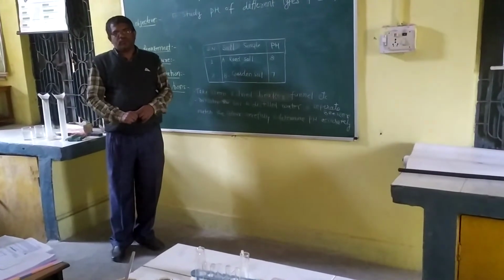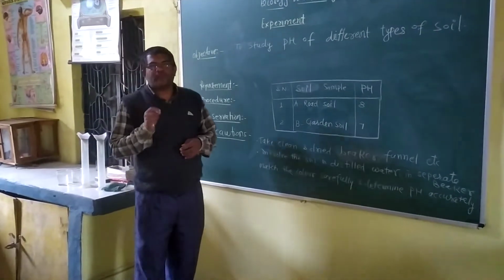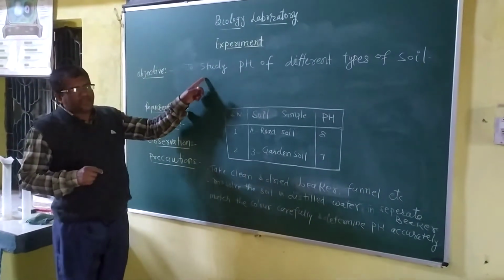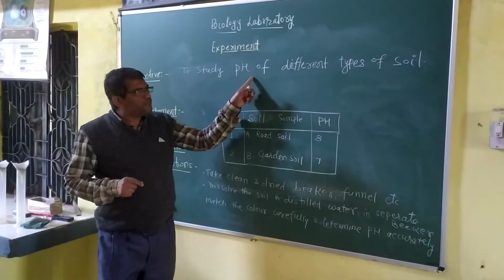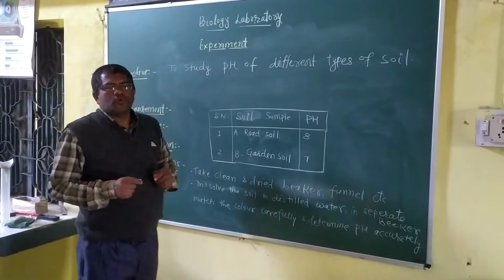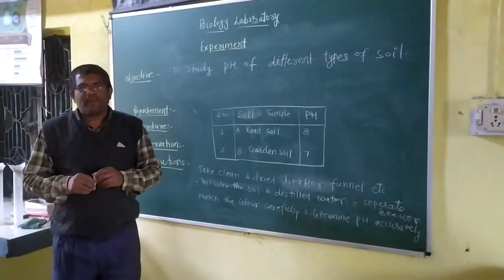Good morning, children. Today we are performing another experiment of 12th class biology, and this is to study the pH of different types of soil. So we have to know the pH of the different types of soil.